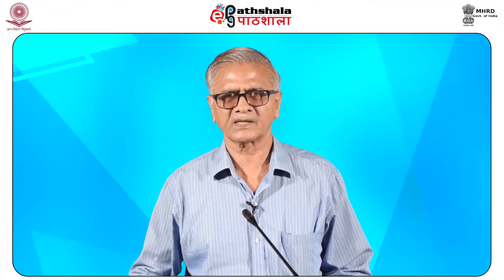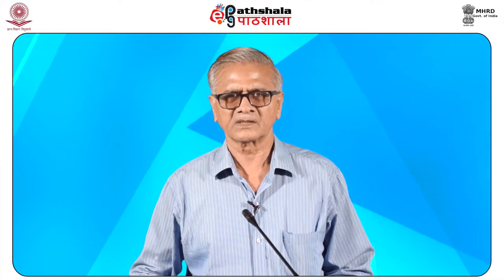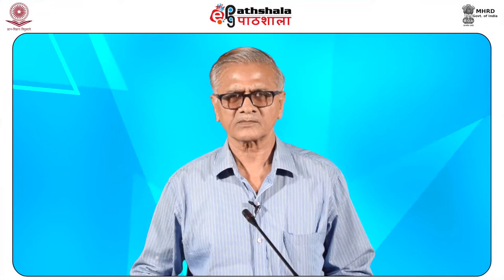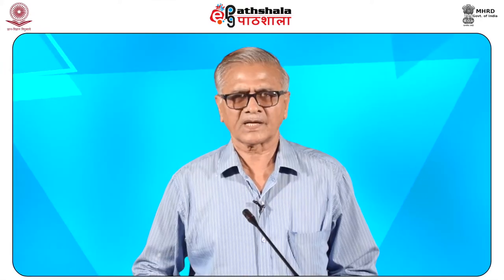The dark band in a lane indicates a DNA fragment that is the result of chain termination after incorporation of a dideoxynucleotide. The relative positions of the different bands among the four lanes are then used to read the DNA sequence from bottom to top. The technical variation of chain termination sequencing includes tagging each dideoxynucleotide with fluorescent dye.